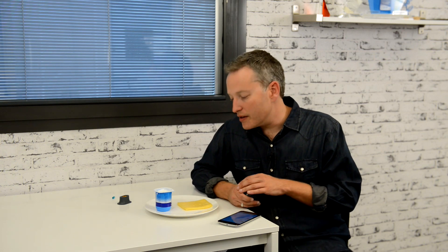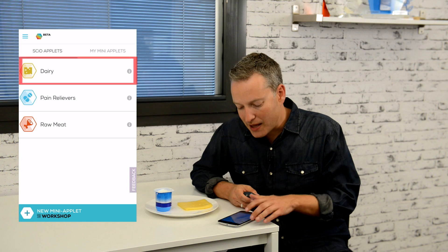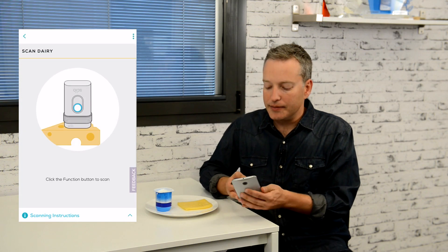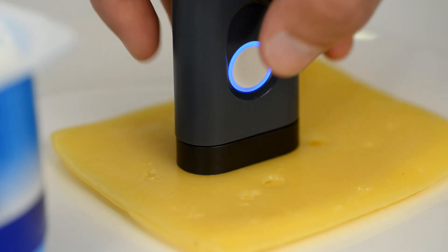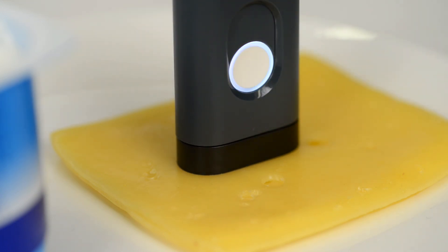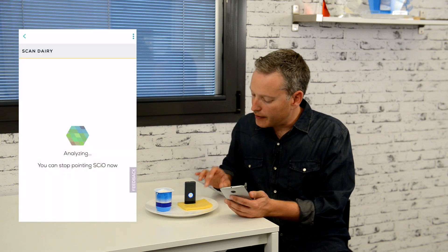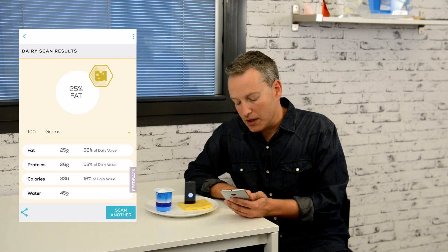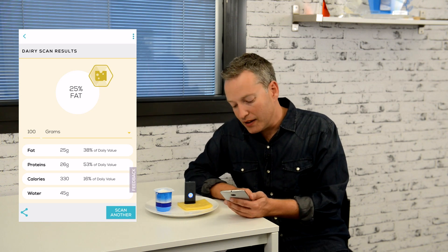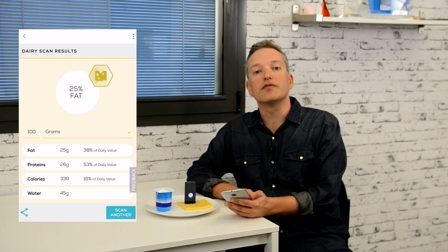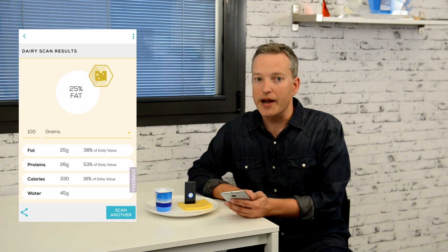Let's take the dairy applet as an example. I have a slice of cheese here and a yogurt. I'm tapping the dairy applet and scanning the cheese. Note that I'm using the optical shade for optimal scanning, and I'm practically making contact with the sample. This slice of cheese has 25% fat and 26 grams of protein in every 100 grams.